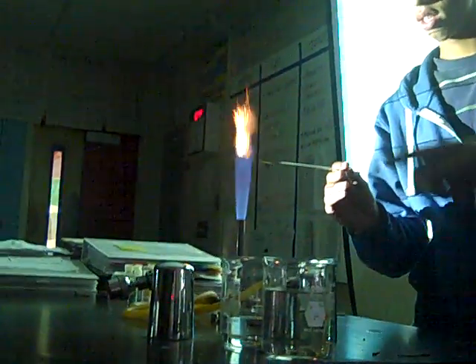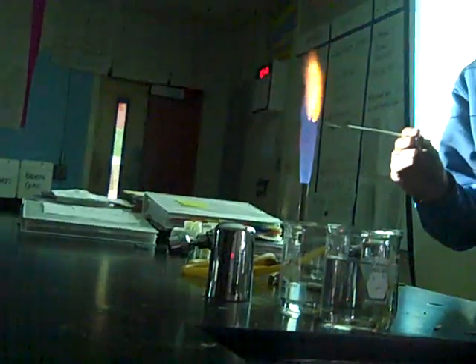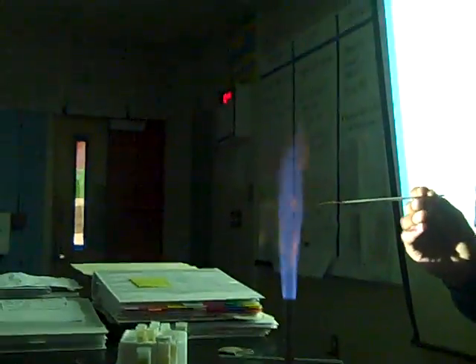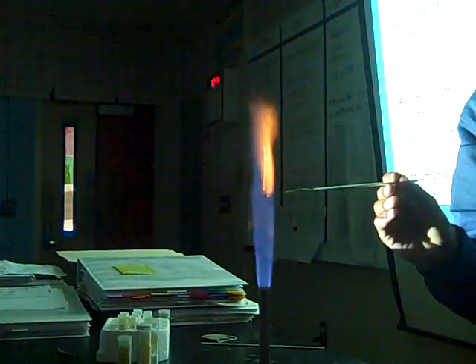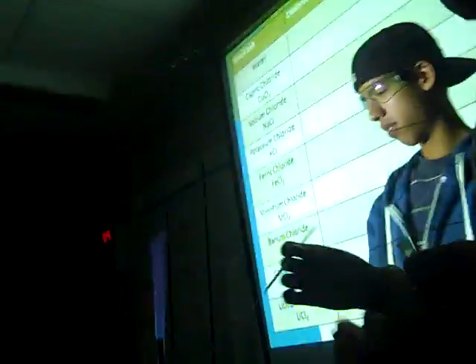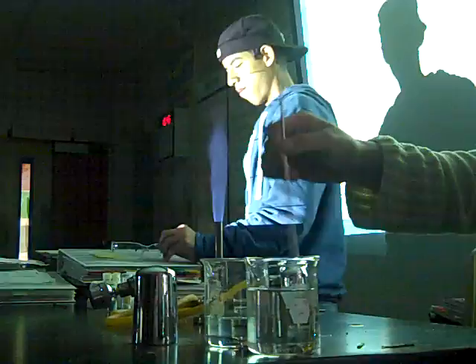Yeah. Okay. We'll do it one more time. It had a good chunk, but it fell low. Oh, right there. It burns off pretty fast. We'll do it. We'll do it one last time. It looks like a flame. Okay. Right at the beginning when Guillermo puts it under the flame. See what happens. Pay attention. Pay attention. It happens pretty fast. What did you see? Flare. More sparks. More sparkles. More sparkles. Right. Thanks, Guillermo.